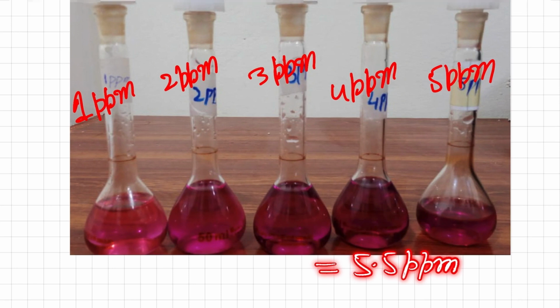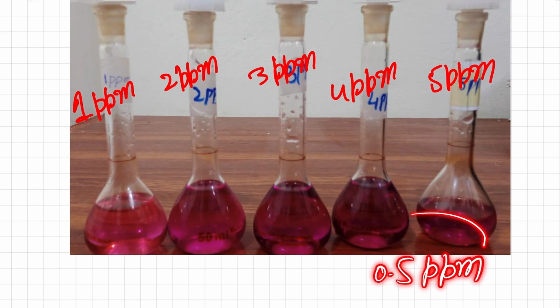So in the final answer you will deduct the added amount, and after the calculation you will give the final answer. So by using this method, which is called the standard addition method or pre-concentration method, you can even measure solutions which are below the detection limit of the instrument.